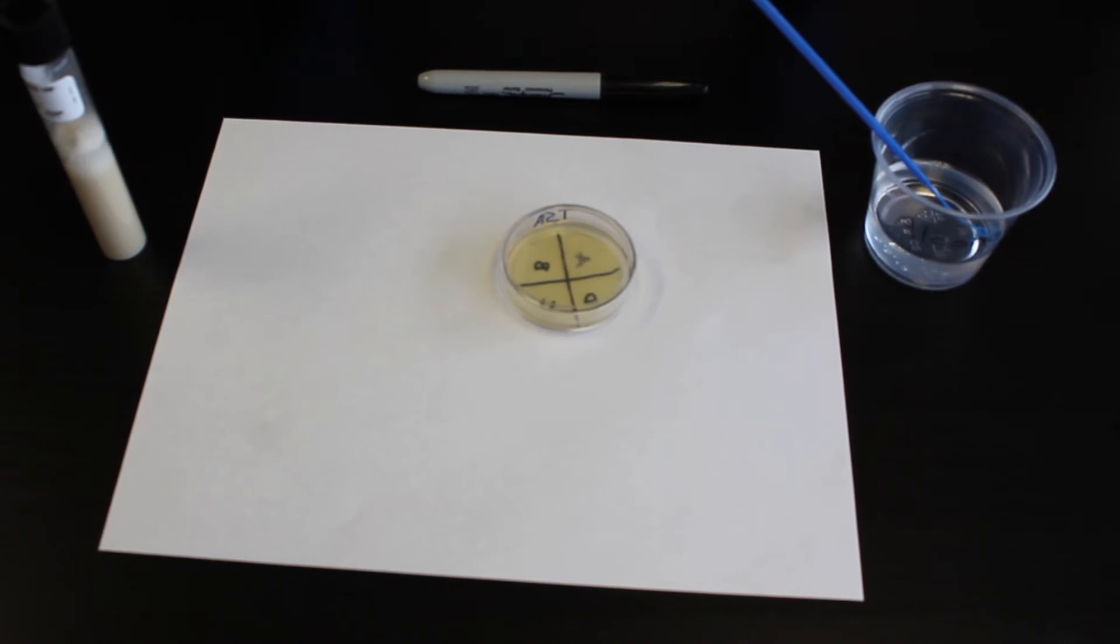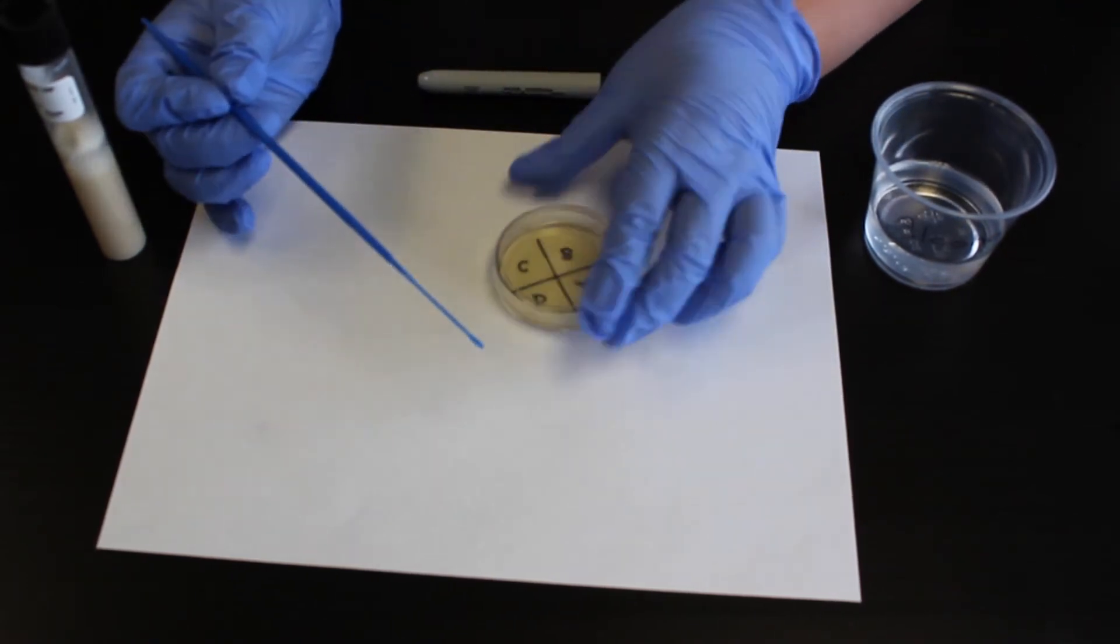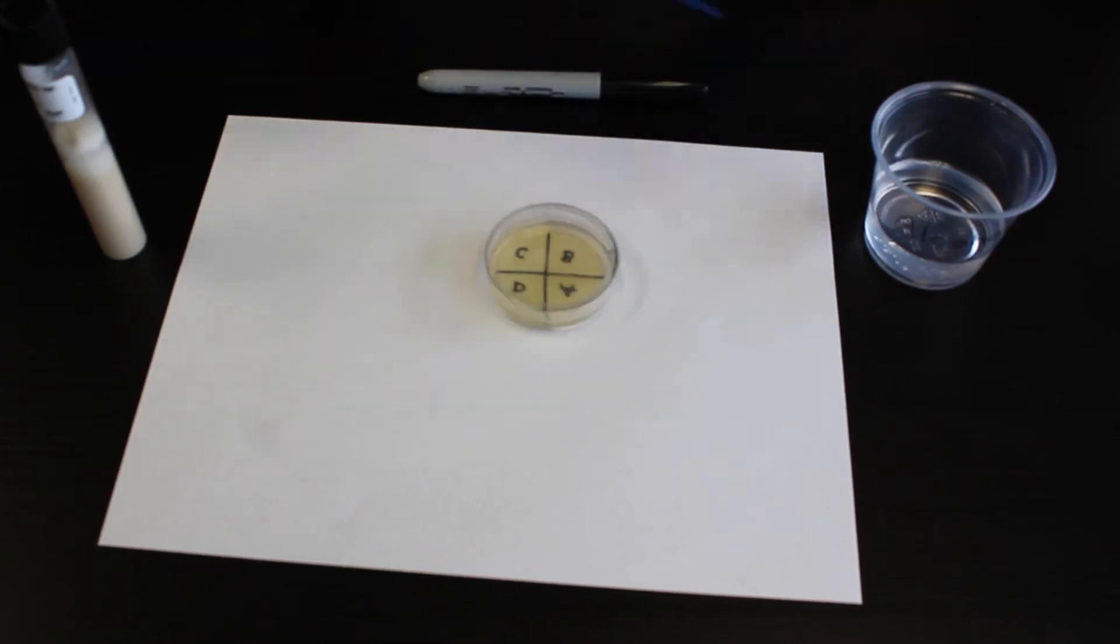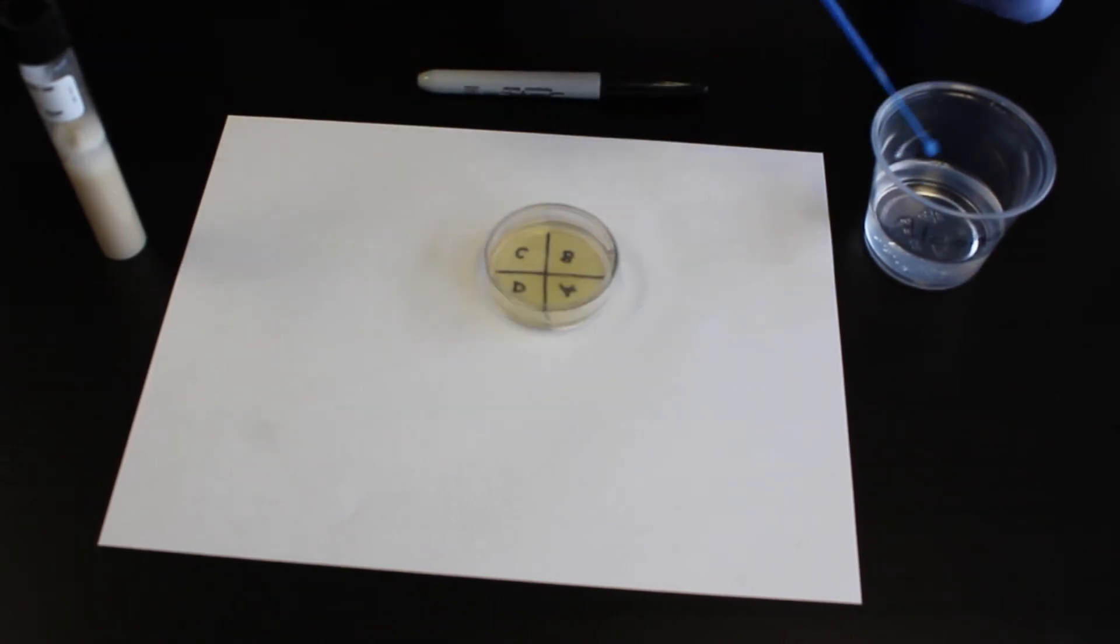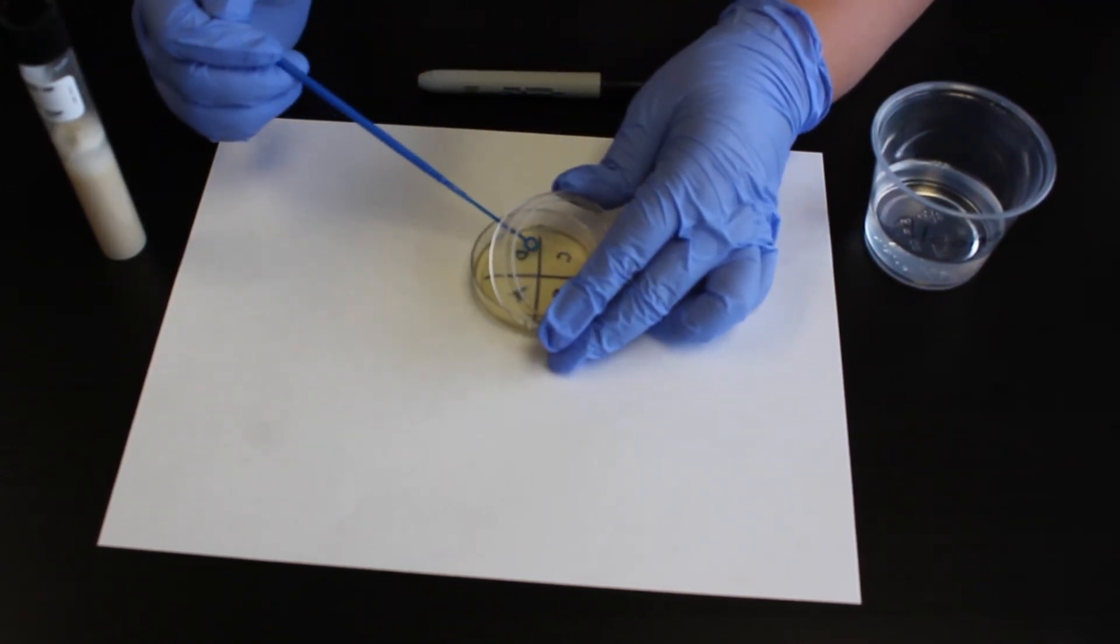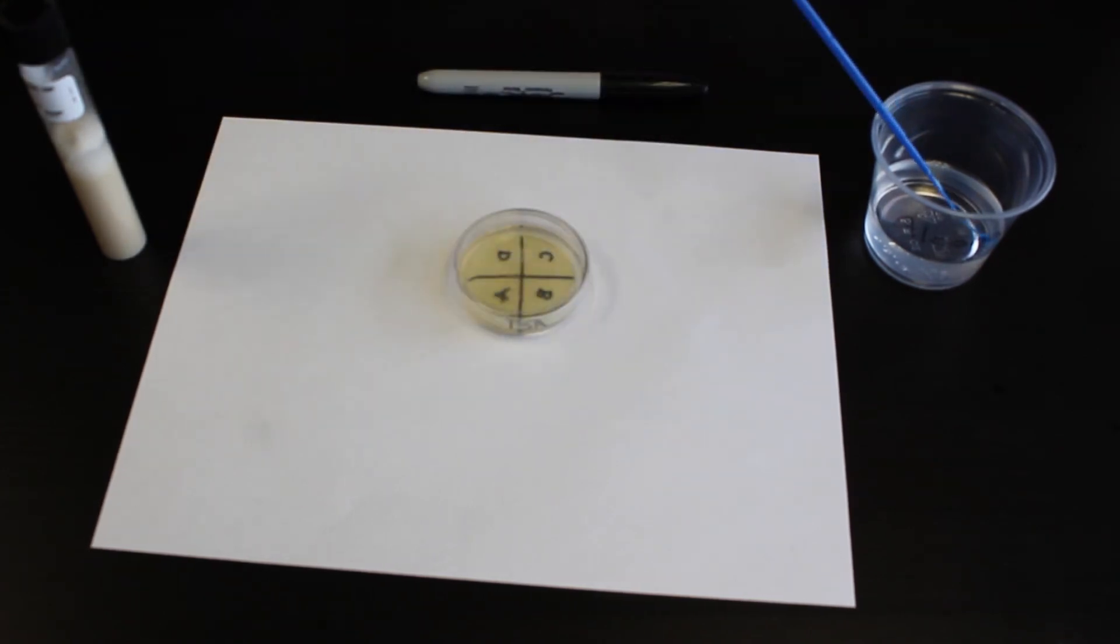Repeat until quadrants C and D are streaked. Store the streaked plate agar side up in the incubation location.